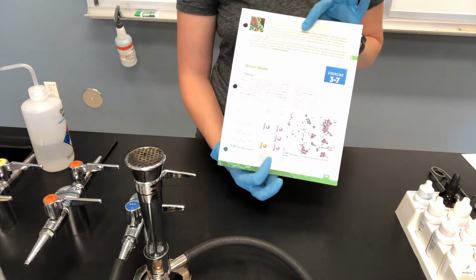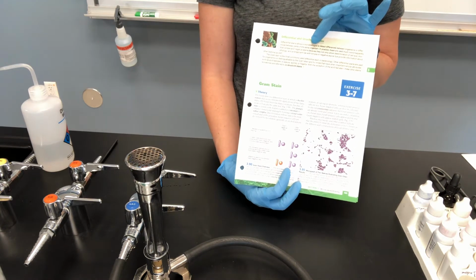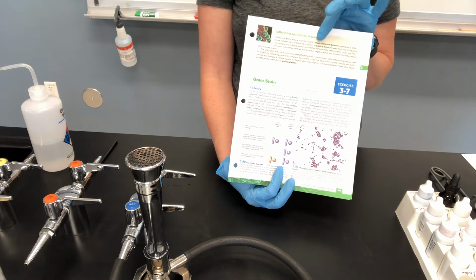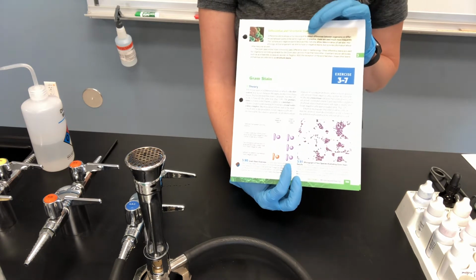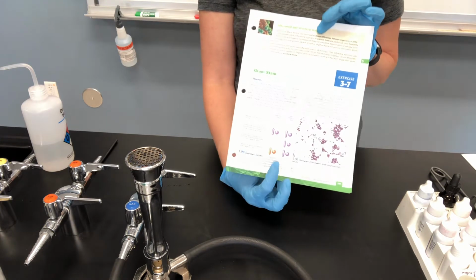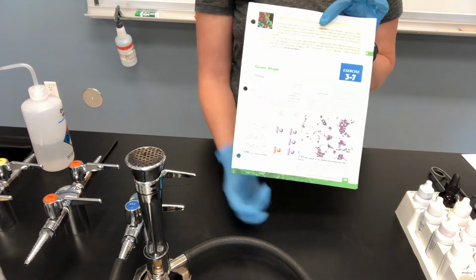Christian Gram figured out that these two different groups of bacteria have different physical features, and when they go through this staining process, they come out as different colors, which is really nice to help differentiate different groups of bacteria. If you go through the gram stain process and you get purple cells, these are what we call gram positive. And if you have a pink outcome, this is called gram negative. So we have gram positive cells and gram negative, and that's what we're going to be looking for.